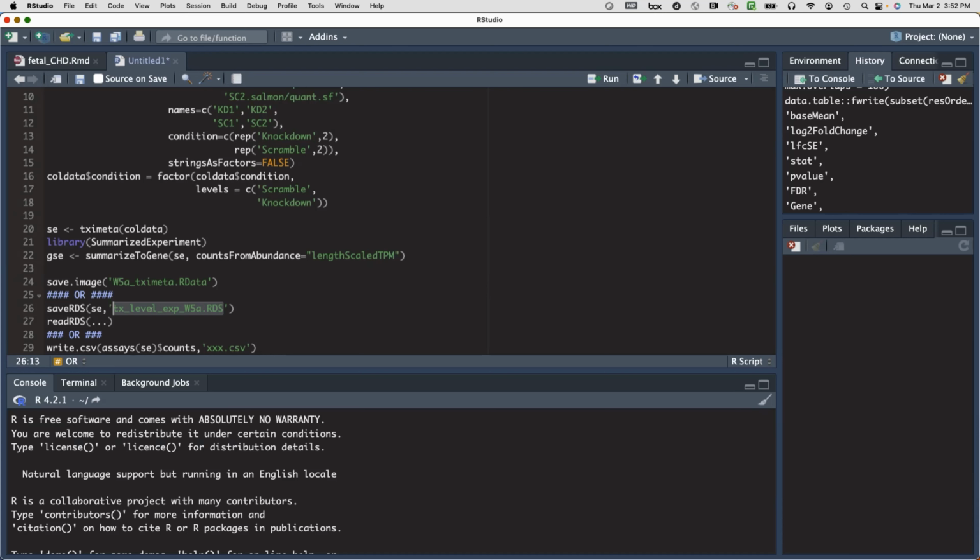Actually, my run is still running. Should I wait for it? It's up to you. Because you know the terminal is very slow right now, so I'm not sure. Start again later? Yeah. So all this is recorded, and the last term's recordings are also available. So if you don't want to wait until it finishes here, you're totally free to go. But I can be here until 4:30 if you run into errors or anything. Okay, thank you. Yeah.